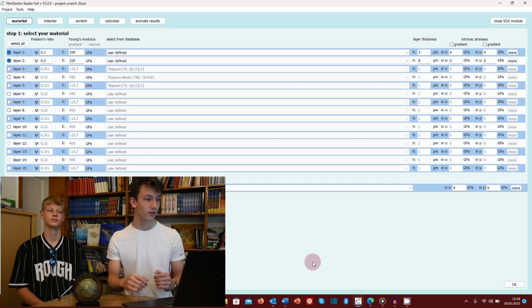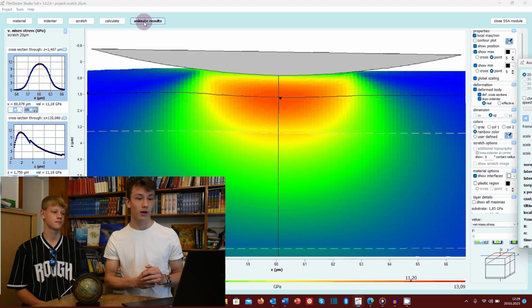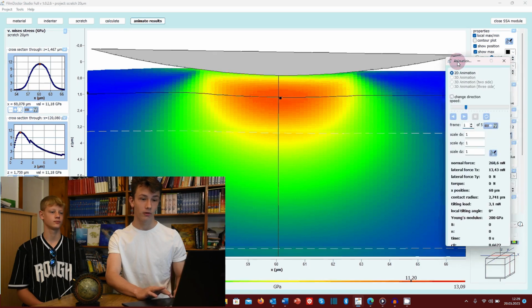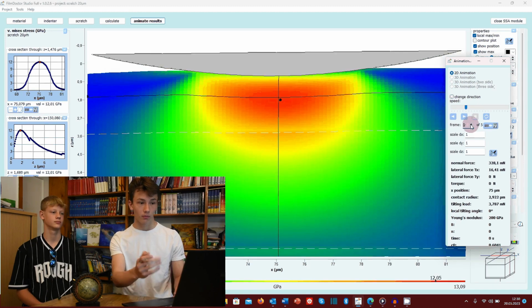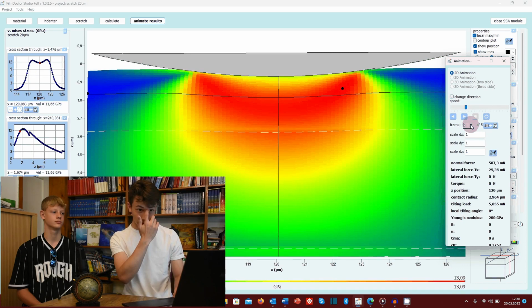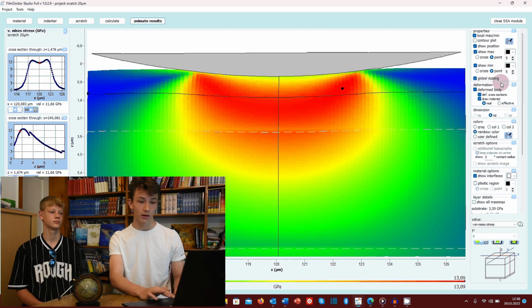So this is just one example. With everything done, just go and watch my first video about SSA to know more about how it really works. But in the end, you're going to get something like this. Those are my results, with many animation steps. Over here we can click through the many animation steps to see what happened when we scratched. And this is basically it.